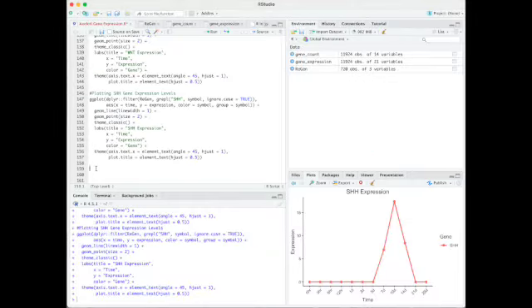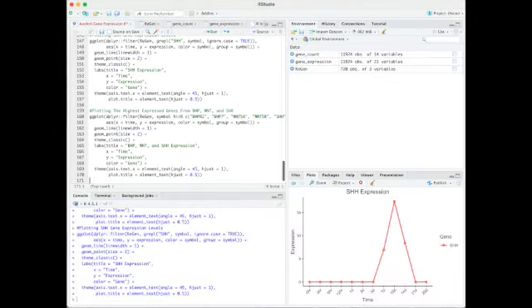For our final plot, we will compare the highest expressed genes within the BMP plot, WNT plot, and the sonic hedgehog gene. To examine the expression levels between these highly expressed genes, we will filter them out of regen and then plot, using the dplyr filter and %in% to identify the specific genes listed: BMPR2, BMP7, WNT5A, WNT5B, and SHH, and then plotting with ggplot to show a line graph.